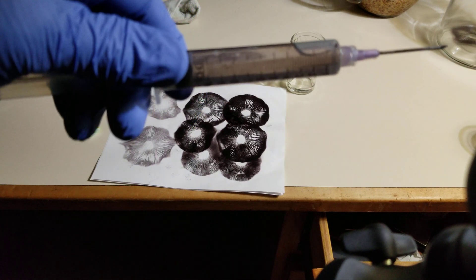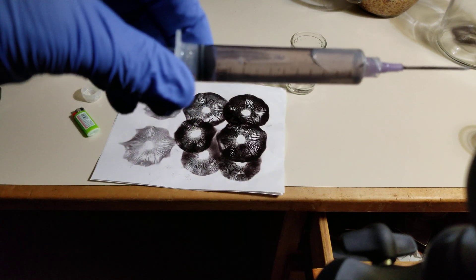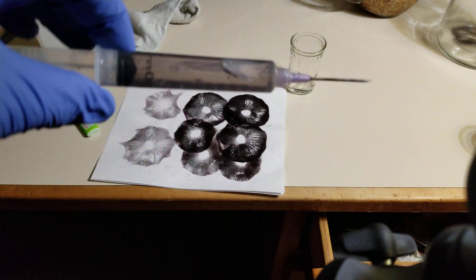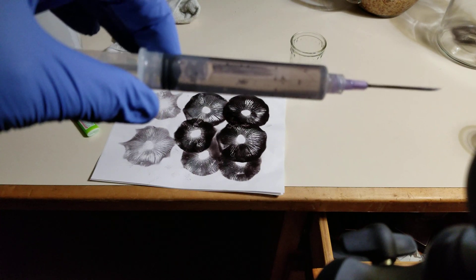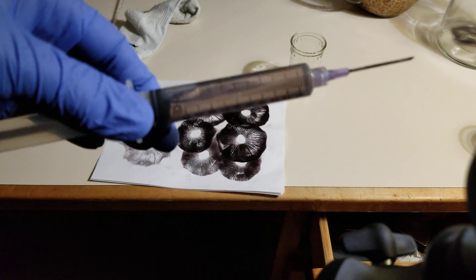This spore syringe is ready to start a culture. This can be used to inoculate liquid cultures or directly to grain. You can dilute it many times, or you can start another liquid culture and withdraw directly from the culture to make mini syringes if necessary.